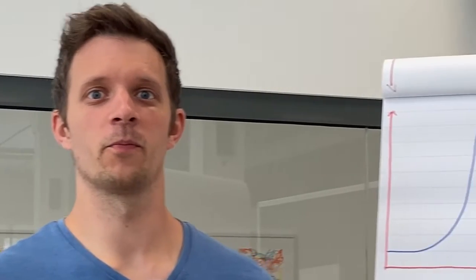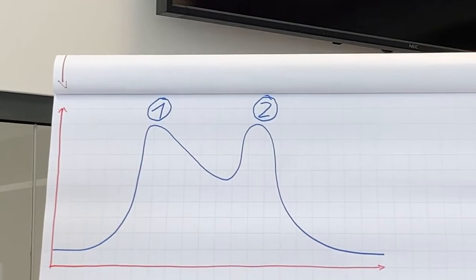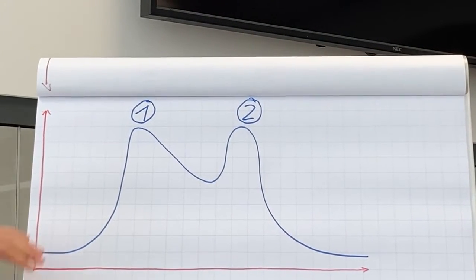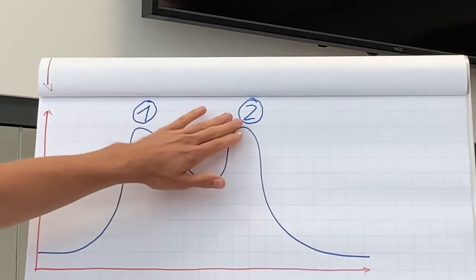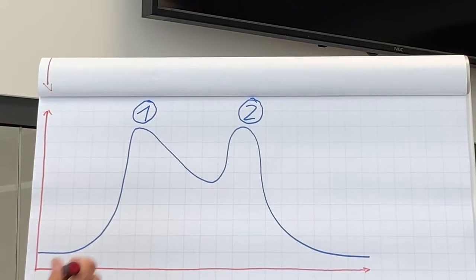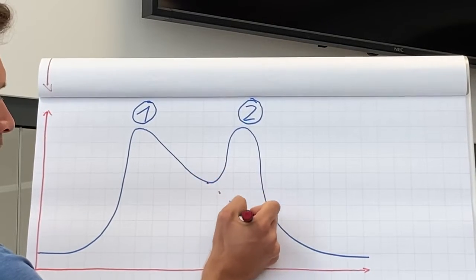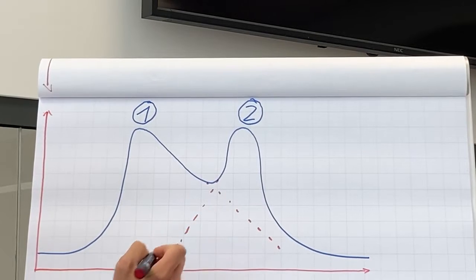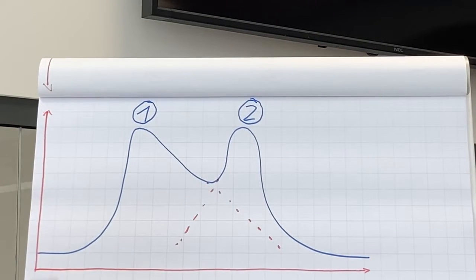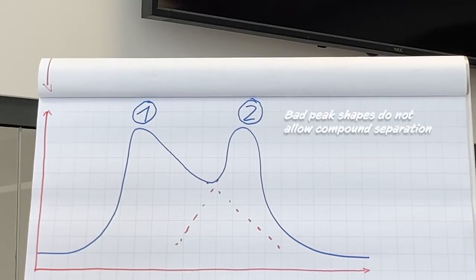But what do bad peak shapes actually look like? As you can see, peak number one and peak number two overlap and they are not separated. But why is this bad? Both peaks cannot be fractionated separately and we are not able to purify our sample.